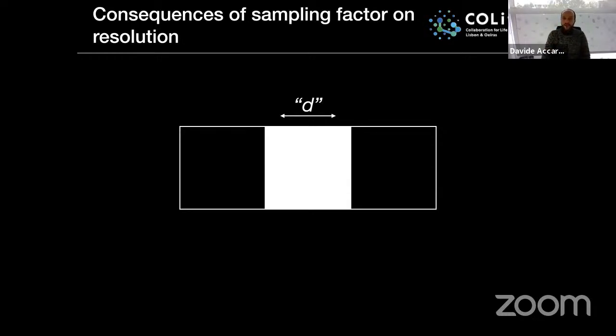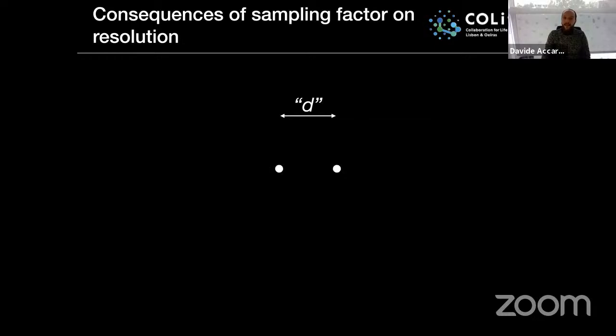Okay, so some of you might be tempted to think that having a pixel size equal to the minimum resolvable distance might be sufficient. And this is because below the minimum resolvable distance, there is no analog information that counts, right? It's true that we cannot resolve below the minimal resolvable distance.